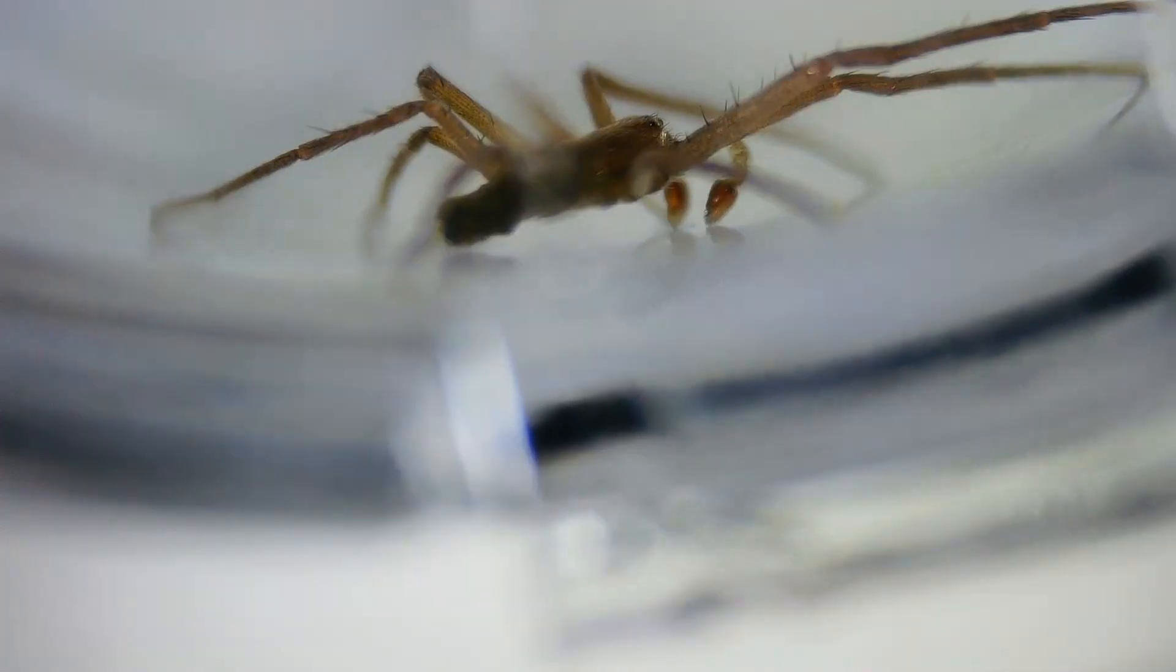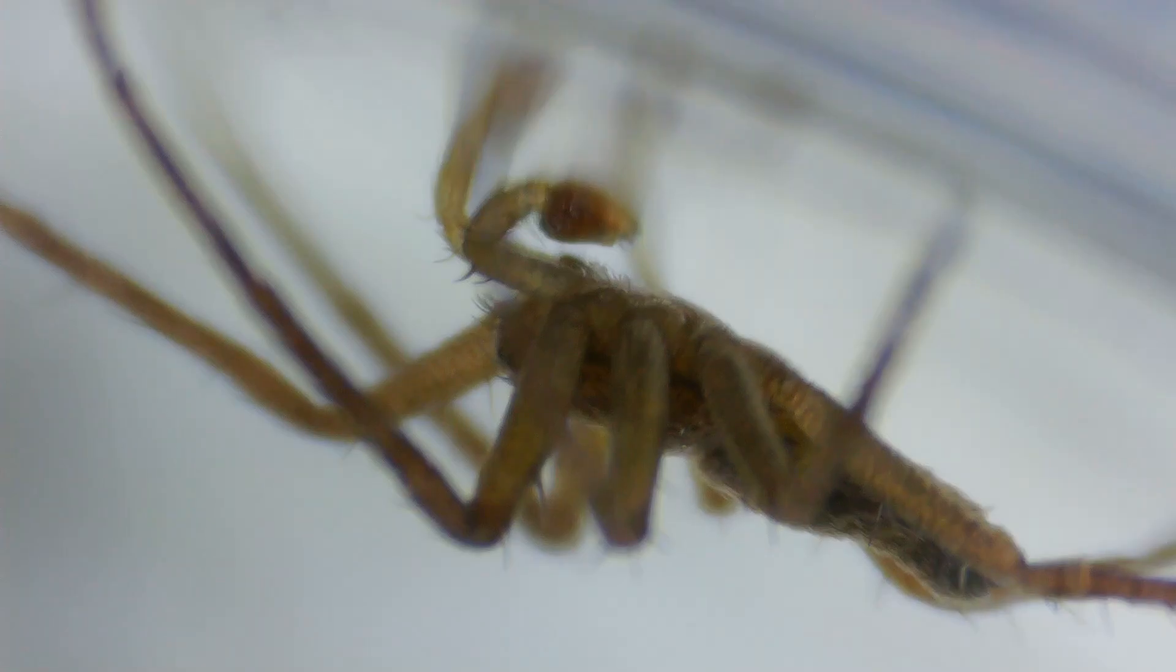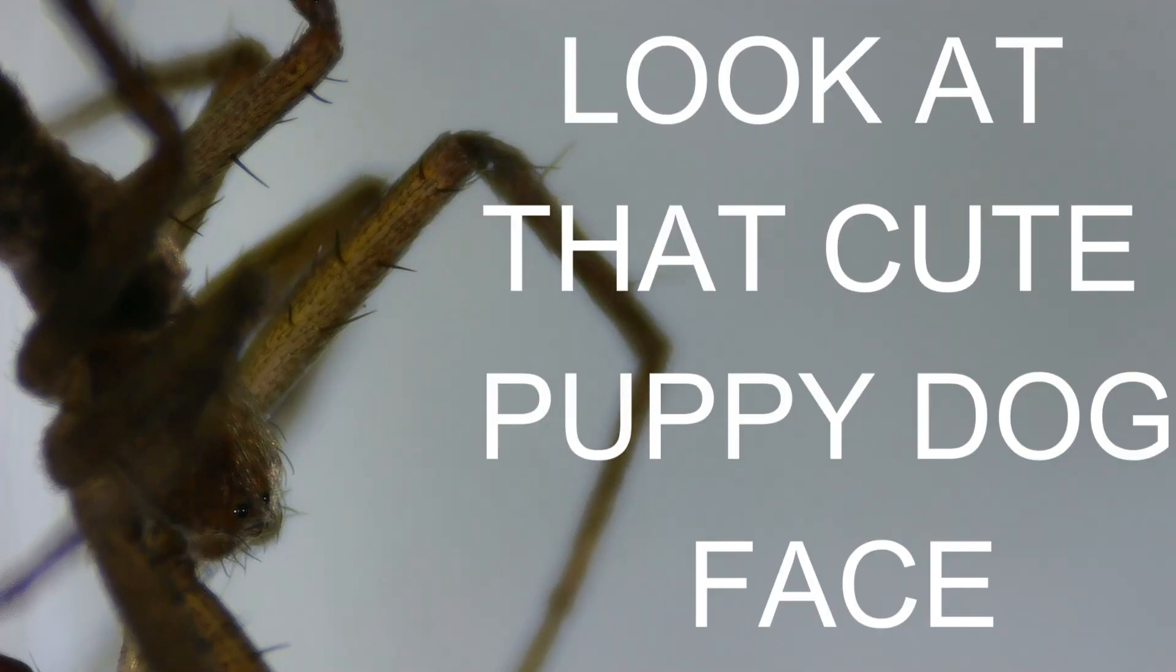Look closely at its body under the microscope. That round, bulbous abdomen, a soft tan and grayish color, is more than just a simple sack. It is a sophisticated biochemical factory. Within it, the spider produces silk.